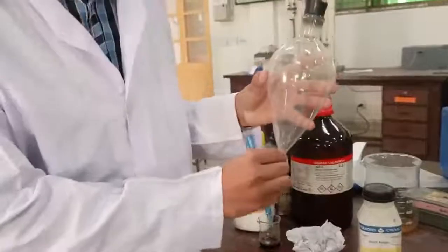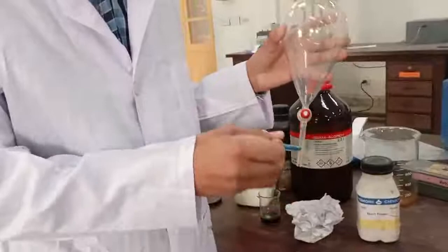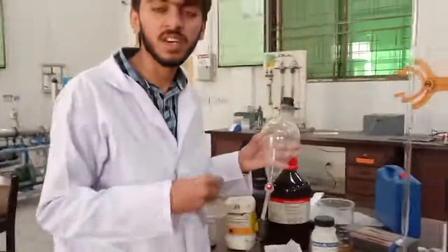By using the separating funnel, we drain out all the CCl4 and we get the iodine-enriched hybrid solution.